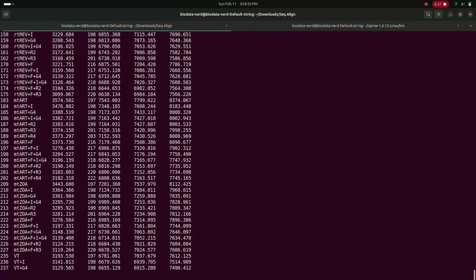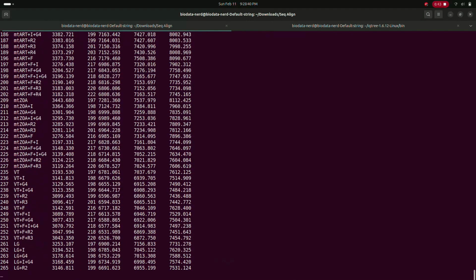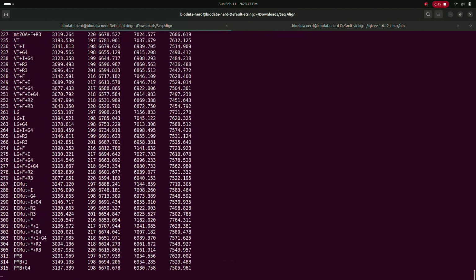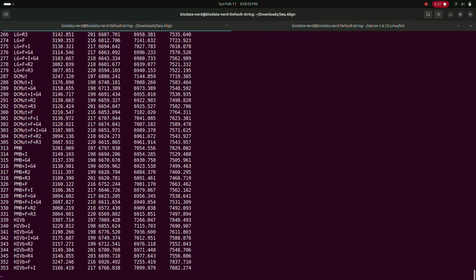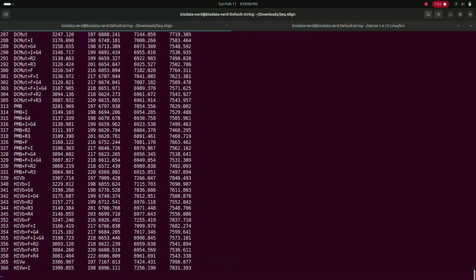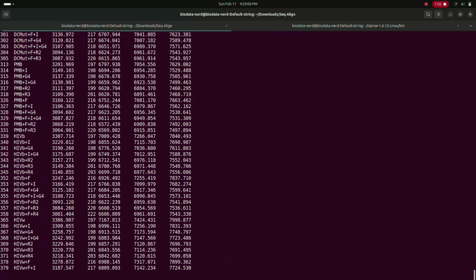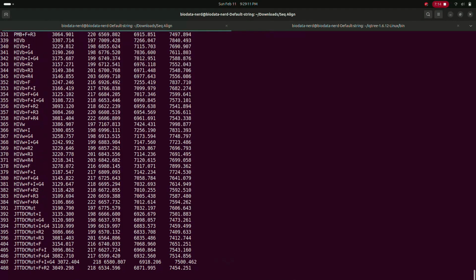You can use this to get the results as well. I will also upload a tutorial on iTOL, which uses this IQTree file to annotate the result and make a beautiful phylogenetic tree. And if you want any other analysis in bioinformatics, for example protein structure, or anything on the Linux operating system, you can just tell me in the Udemy inbox, and I will try to upload tutorials on that as well. So this is, I think, the end of this tutorial series for Bash.